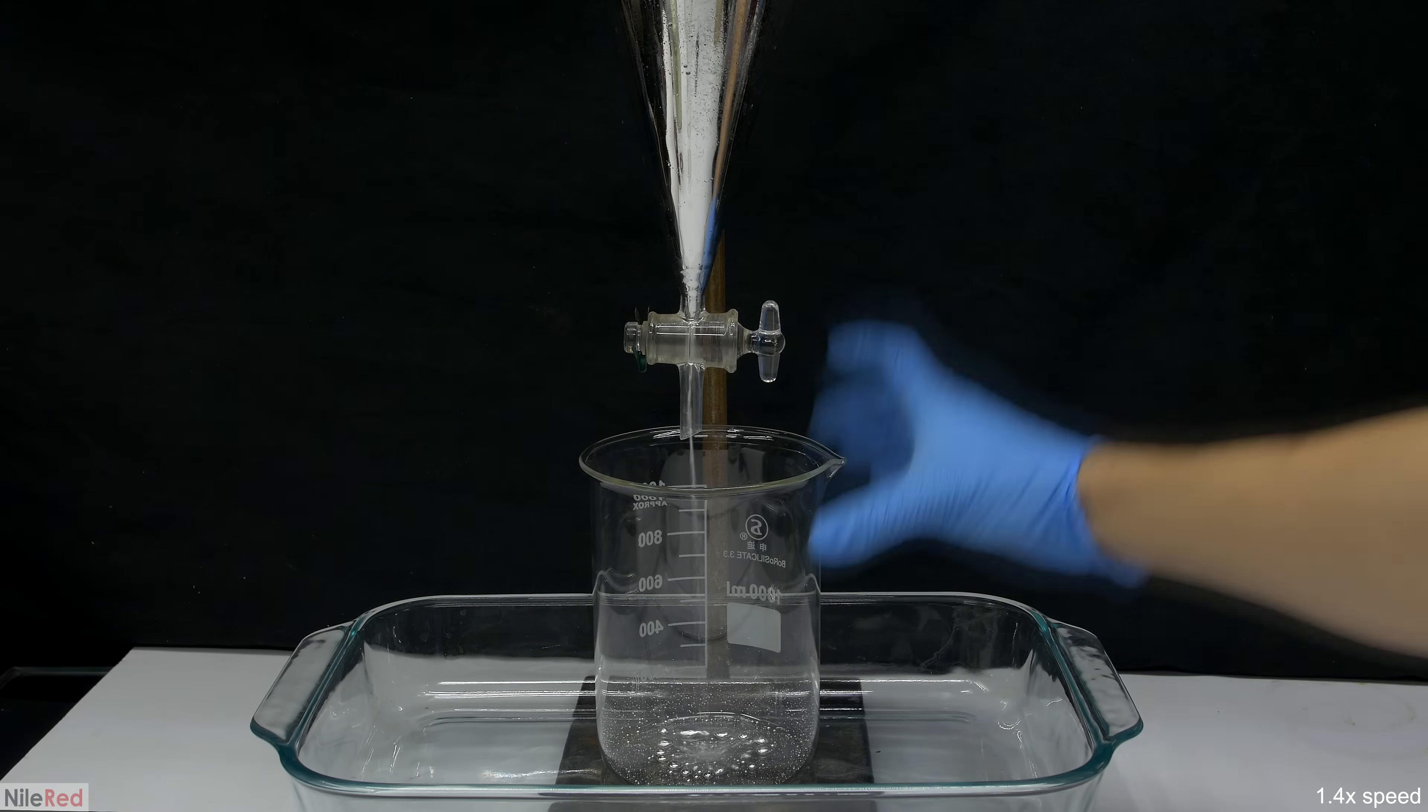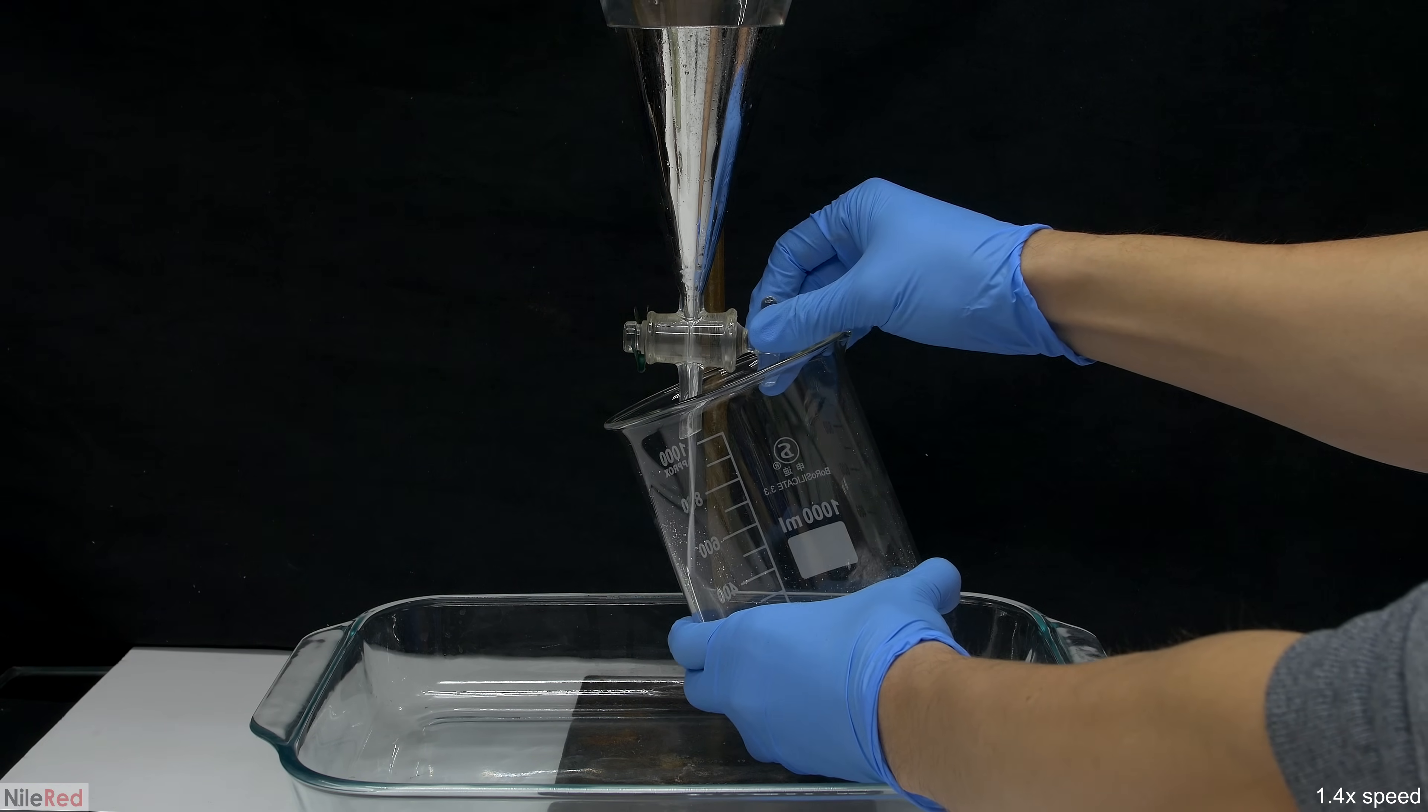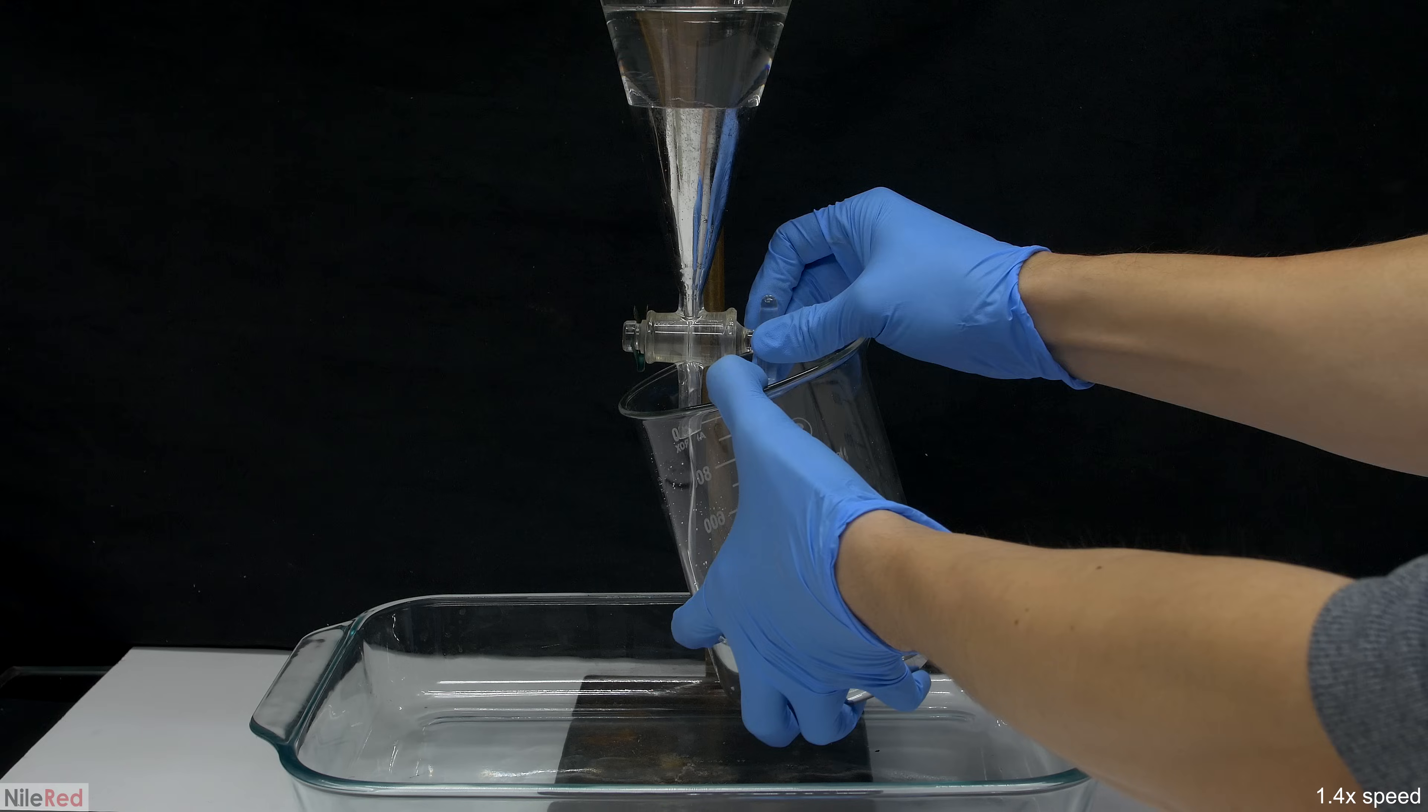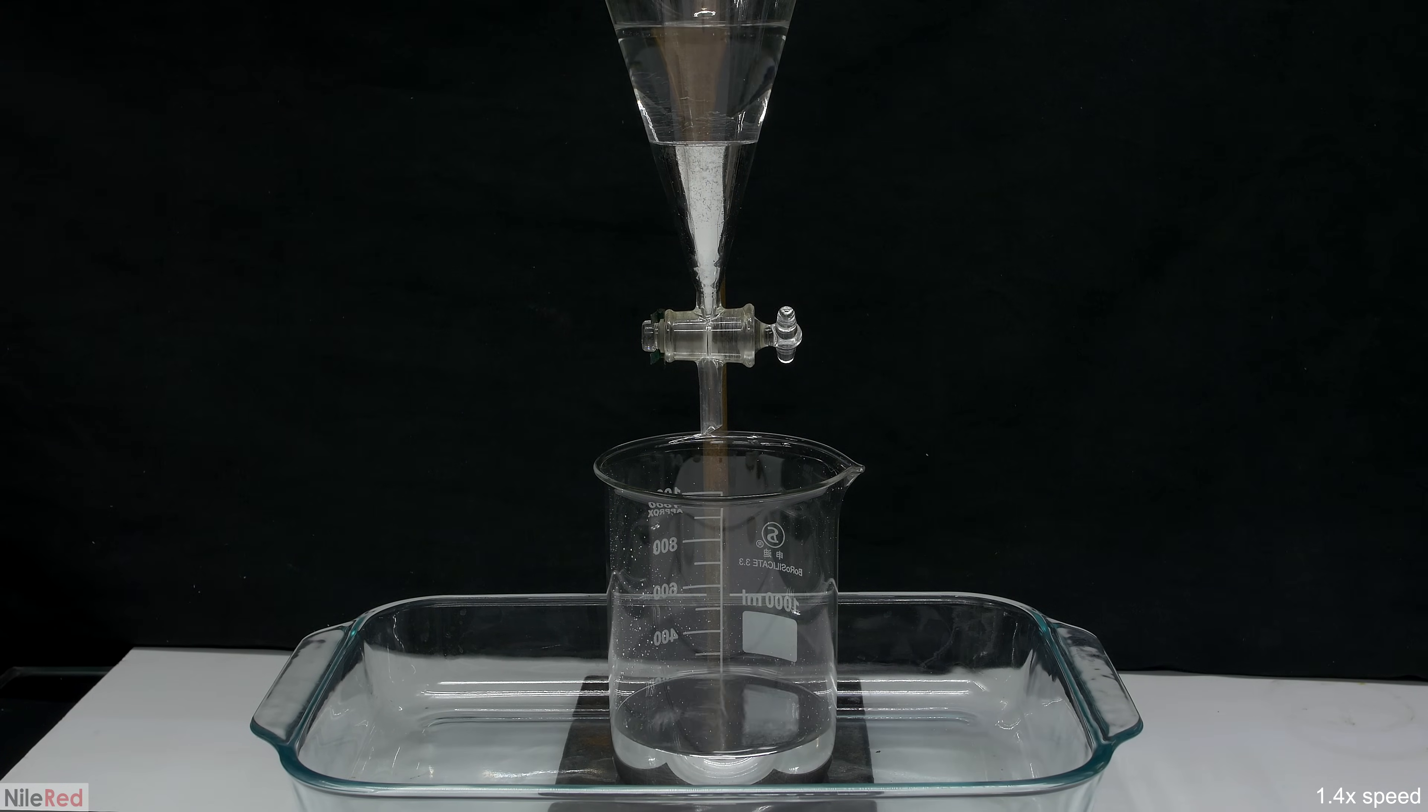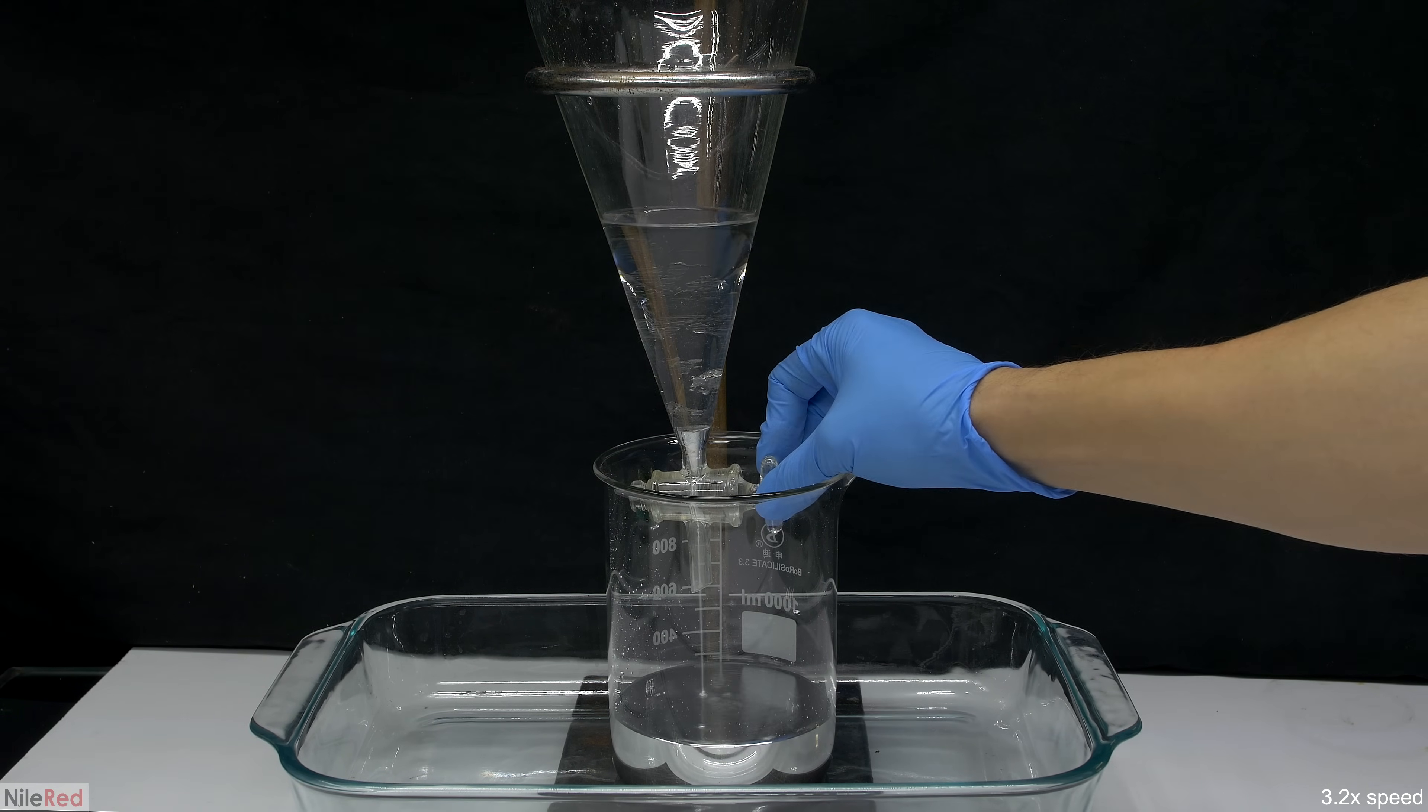After sitting in the separatory funnel for 30 seconds, almost all of the water should have separated so I start to drain the mercury. To prevent mercury from splashing, I had to lift the beaker a little, and unfortunately this obstructs your view a bit. So just for you guys, I stopped draining the mercury and I reposition the sep funnel. This is probably the way that I should have started things off, but anyway now that it's deeper in the beaker the splashing is much less.